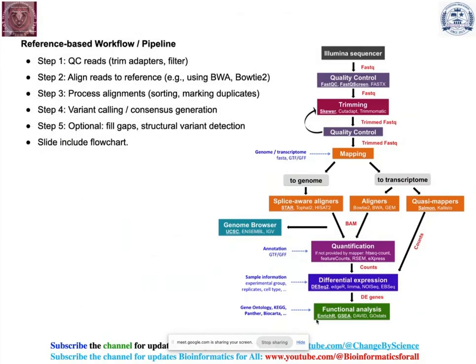Now, as I mentioned, in reference-based genome assembly, the pipeline is quite simple.